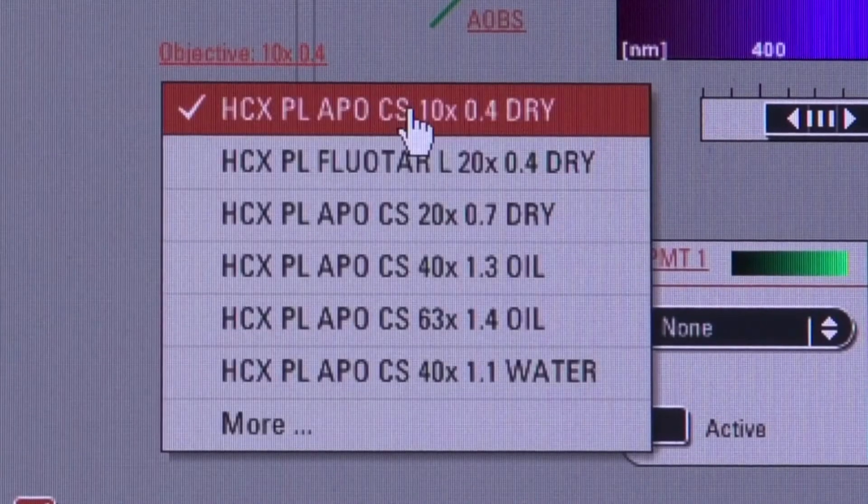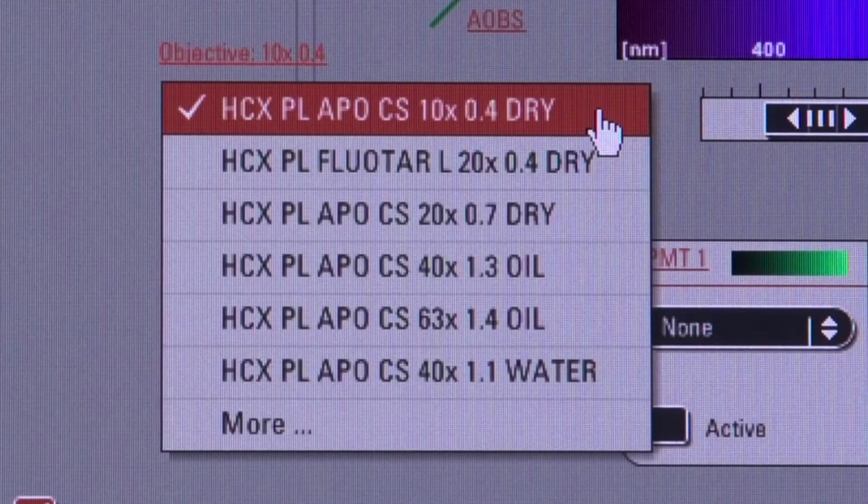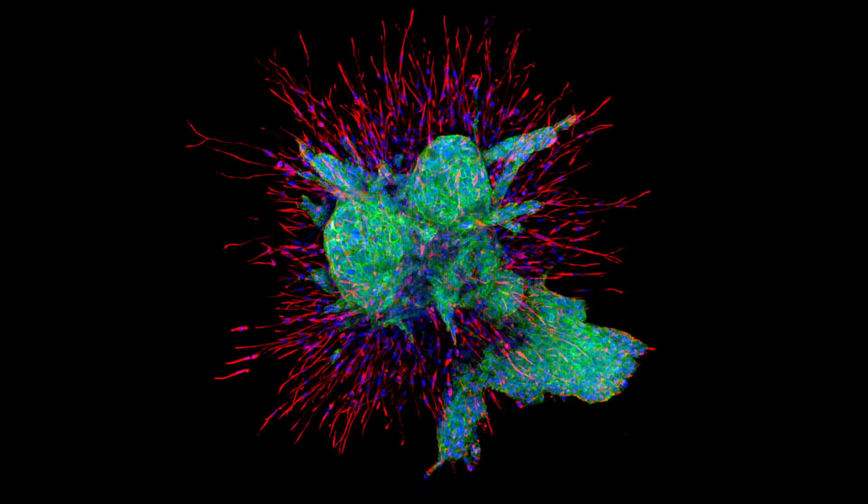That's the distance between the top of the objective and the bottom of your sample. The higher the magnification, the smaller that distance is. Regular culture dishes all have plastic but it's too thick. So let's review the objectives that we have and what they can do for us. First, the 10X objective is our lowest magnification. It has a very long working distance and is perfectly fine to use on just about anything, thick plastic or thin glass. When we use it, it is mostly for large subjects like this esophageal cancer spheroid.